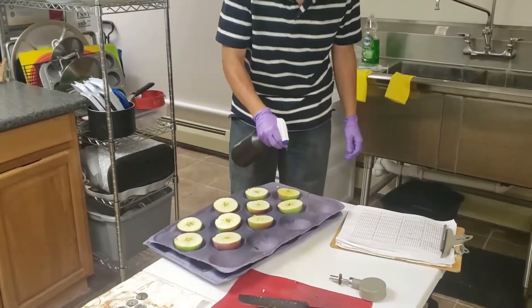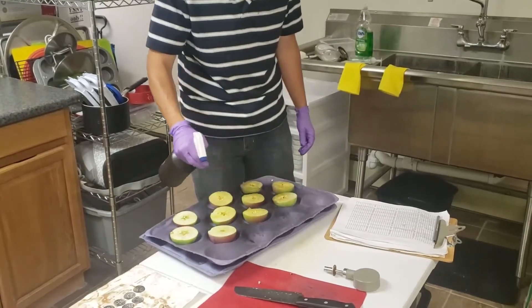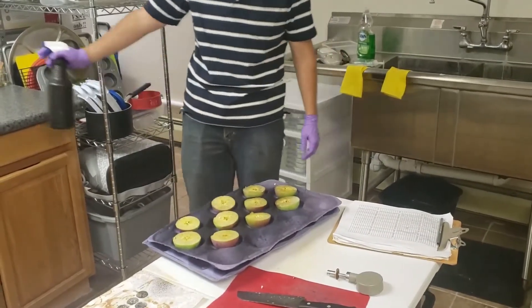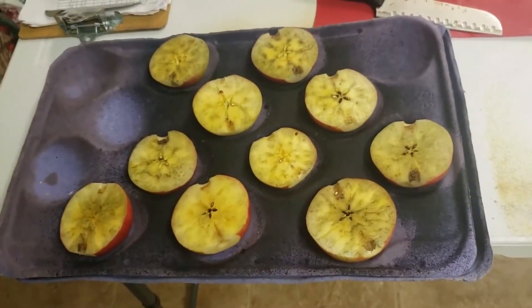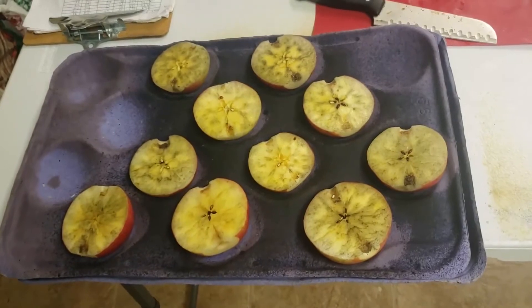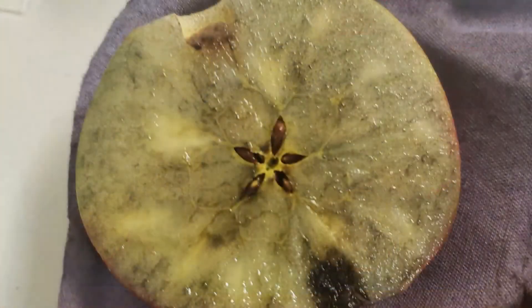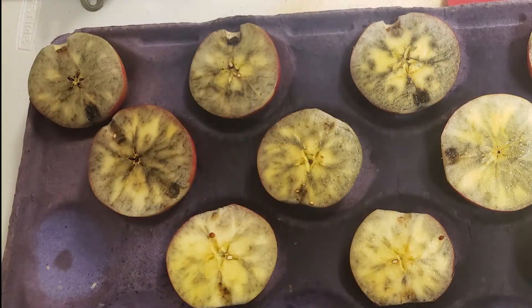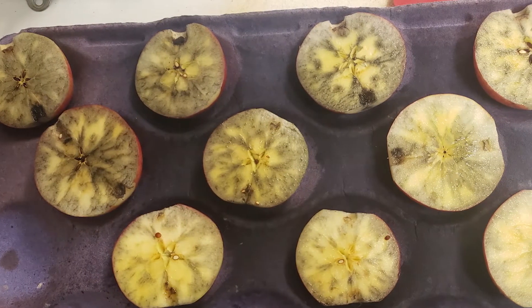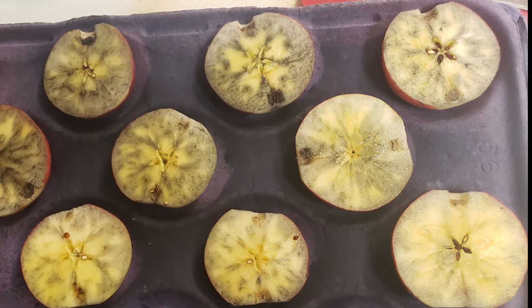The final measurement we will cover is the starch pattern index test. As sugar is produced in apple leaves, it is transported to the fruit and stored as starch. This starch is then slowly changed back to sugars during the period of fruit maturation. The slow conversion of starch to sugar can be observed by collecting the fruit and staining the starch with an iodine solution. This iodine solution stains starch black, while sugar does not lead to a color change, leading to a noticeable starch pattern as fruit maturation progresses.